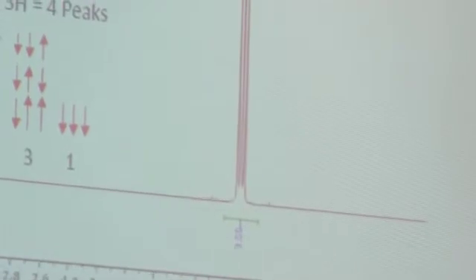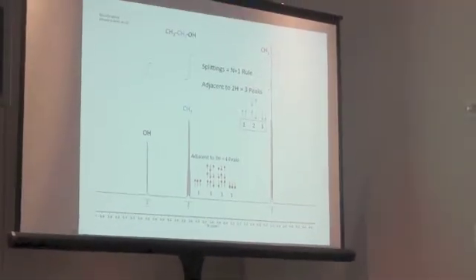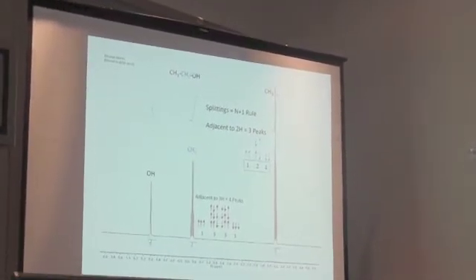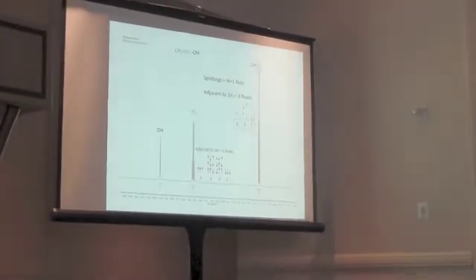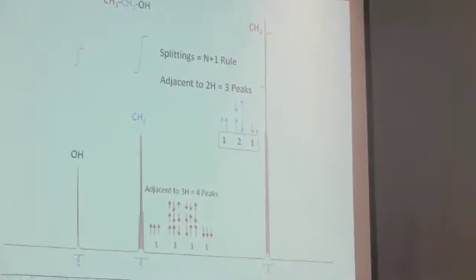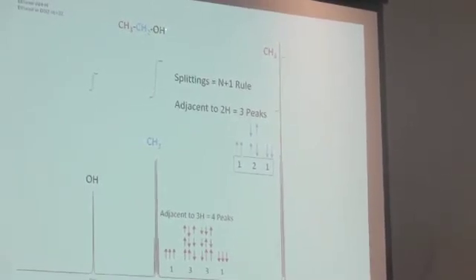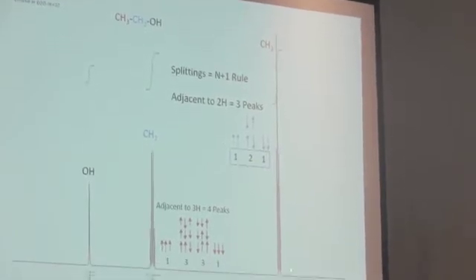And so stay with me with some of the NMR stuff, because it can be kind of complicated, but at the end of the day, it's an absolute technique, which is one of its real advantages, in that the peaks for ethanol are always in the same place on this scale. And they always have a certain look to them, because what you're looking at is the hydrogens in the molecule. So you're looking at either the CH3, the CH2, or the OH of the ethanol. And so this is the CH3 peak.